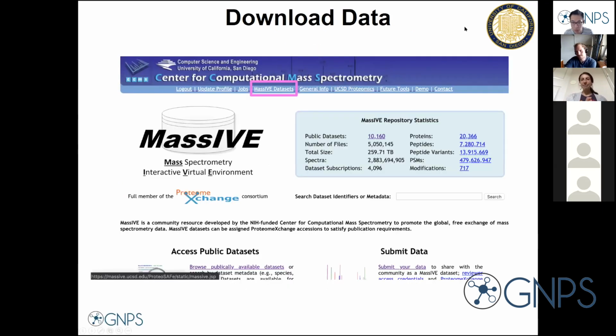So now for the fun hands-on portion. Okay, so we asked you guys to download those 6 files before coming, but just in case, I saw a few questions on the chat. I think there may have been some difficulty with that. So we'll walk everyone through this. Could we get an overview of who downloaded the data and has everything ready? I don't know if people are familiar with giving thumbs up on Zoom. But if you have your data, there's a button so we can see it in the table overview. That might be good for direct feedback.